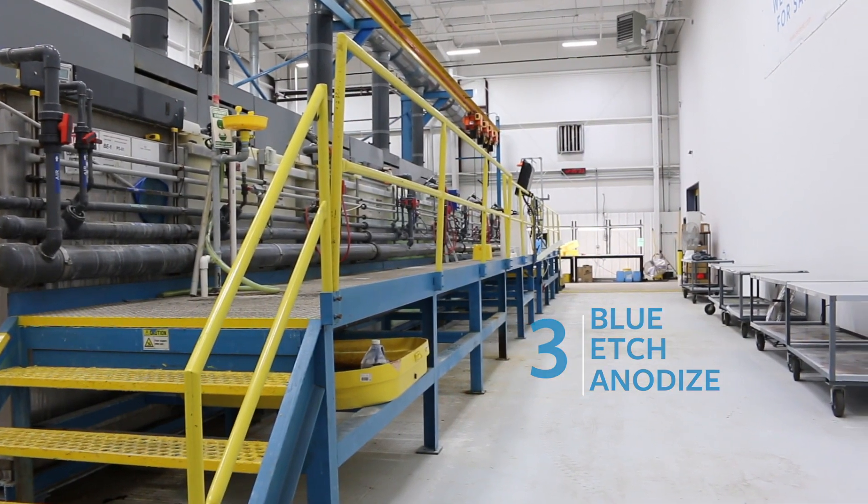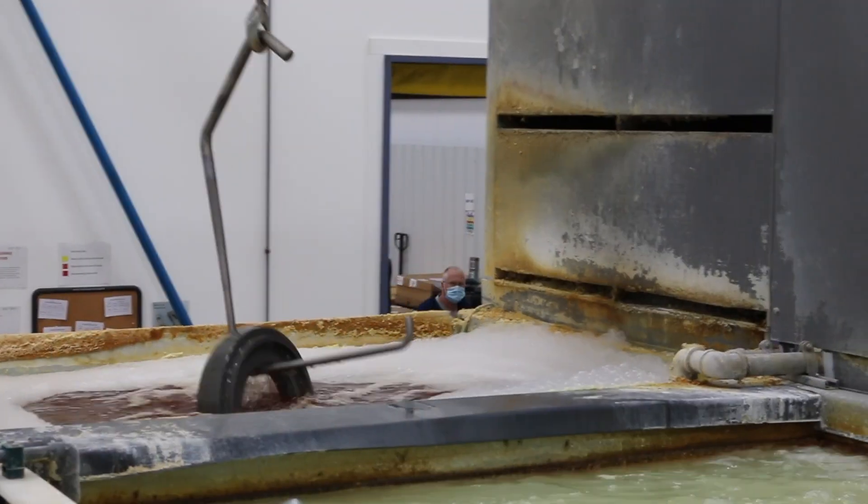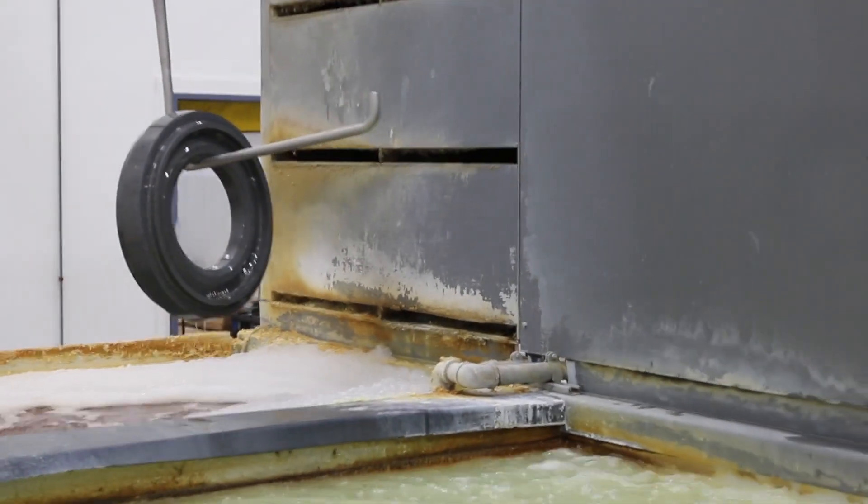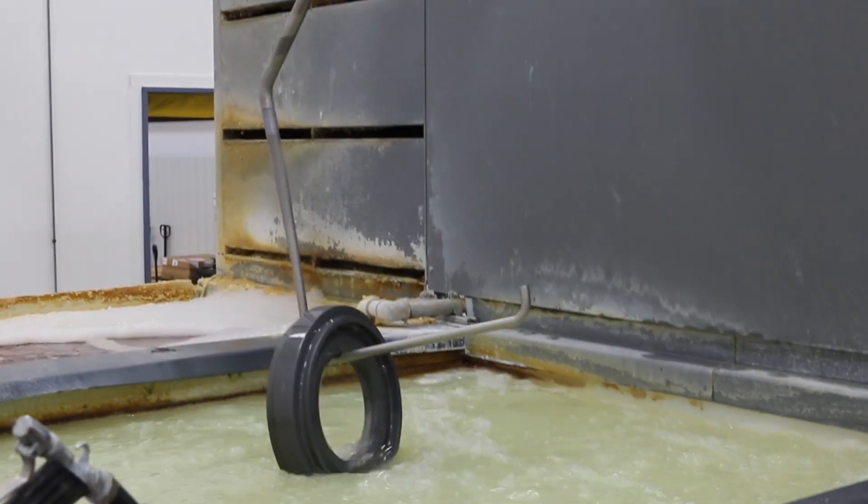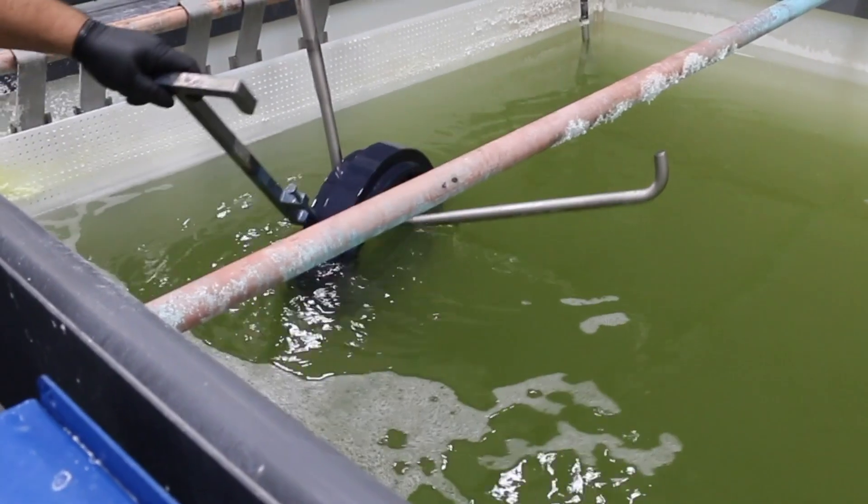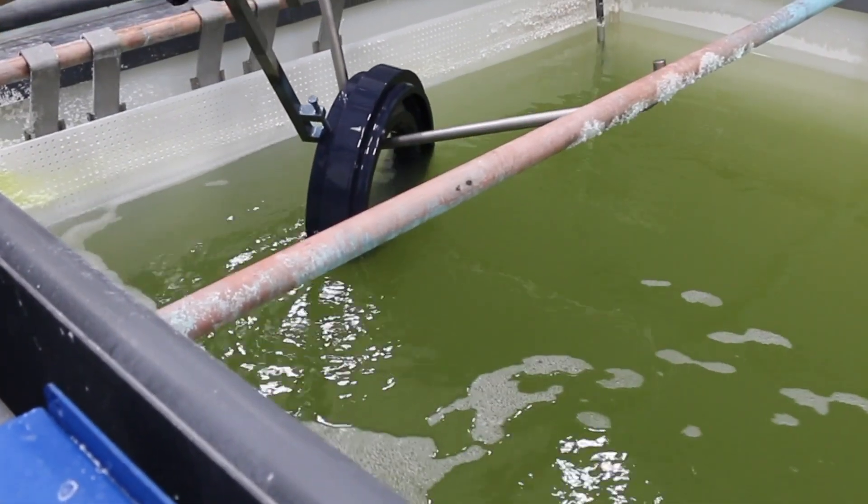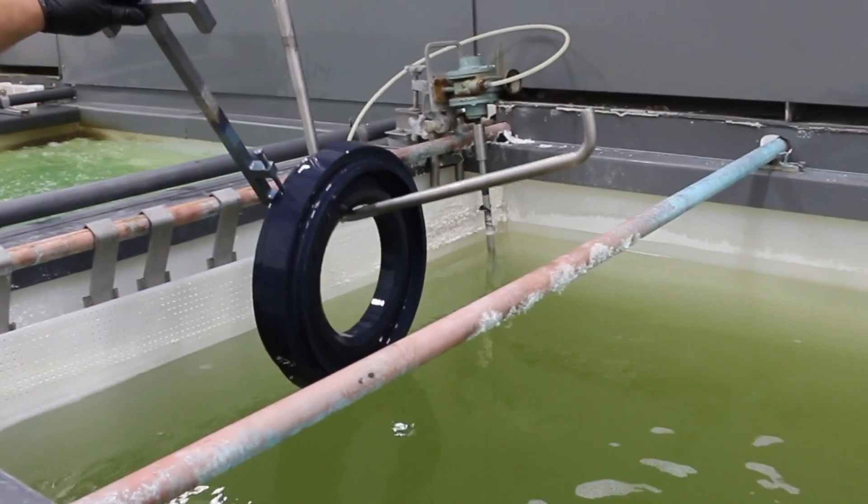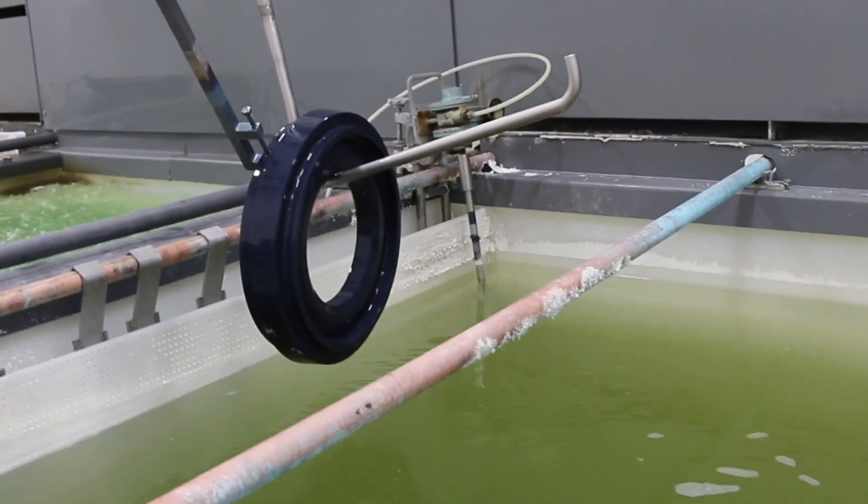Blue Etch Anodizing is a specialized highly sensitive etch inspection method for titanium alloys. BEA has been recognized to be one of the most reliable methods for inspection of critical rotating parts used for the aerospace and power generation industries. It was developed to detect surface abnormalities that relate to metallurgical, material, and machining related discontinuities.